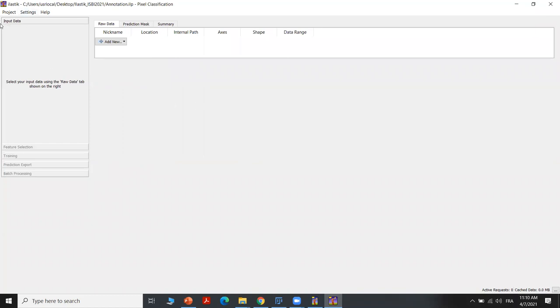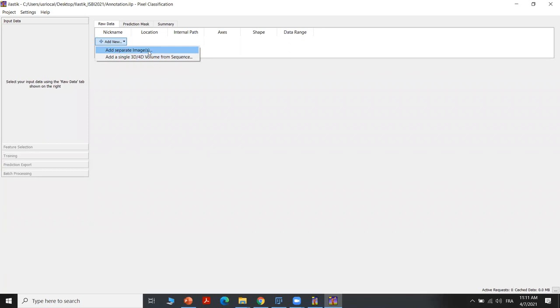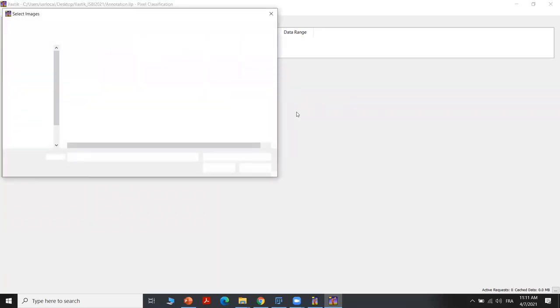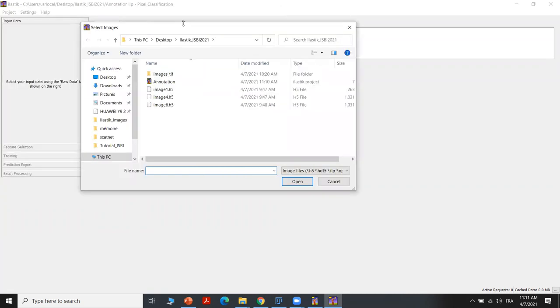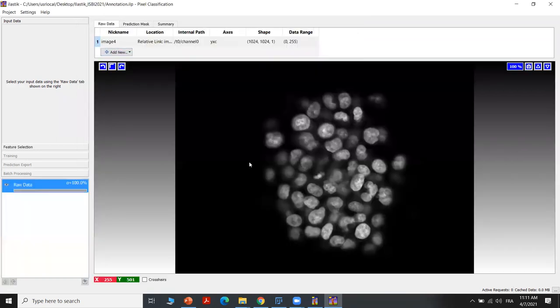We will start first with feeding Elastik with the input data. We can add new data here — either separate images or a sequence of 3D and 4D volumes. Here we'll use only separate images, and then we can choose our image. With Elastik, we can use any format of images: TIF, PNG, or JPEG. But the best format compatible with Elastik is H5. So we'll choose one of the H5 images and open them in Elastik.